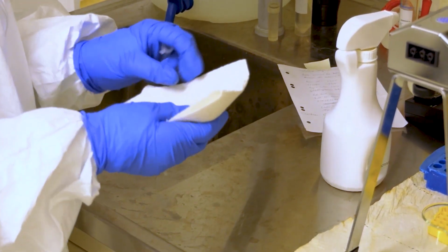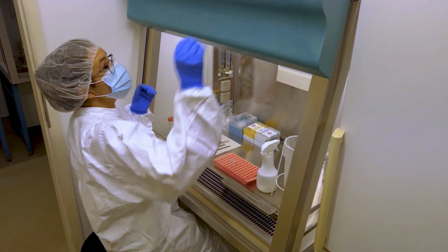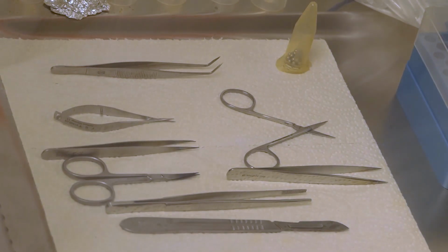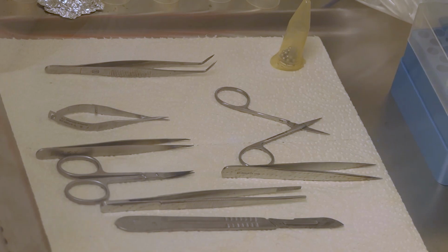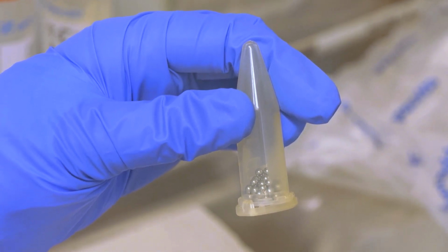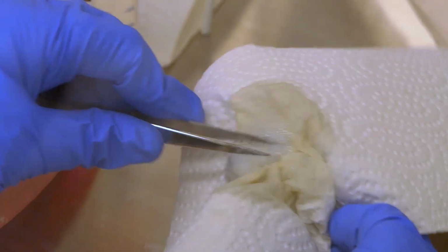Keep in mind to clean all used tools by UV light and DNA Away before you use them for your samples, and keep them clean until usage. This includes all scissors, tweezers, and stainless steel balls in our case. The stainless steel balls are used to crush the legs into fine powder to maximize DNA output in the destructive DNA extraction approach. They are placed into the same tube as the tissue. Remember to clean the tools in between all samples to prevent cross-contamination.